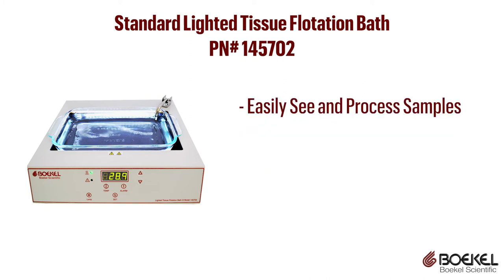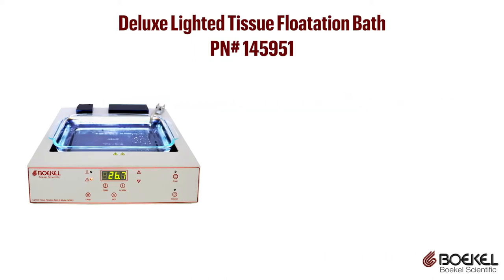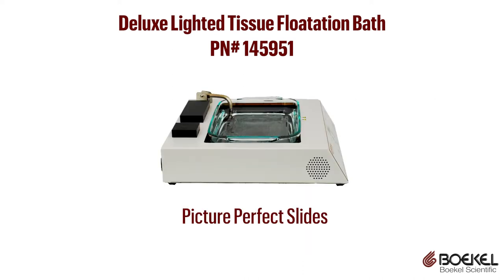Easily see and process samples using this device. The deluxe lighted tissue flotation bath also has precision digital temperature control, but also features a slide dryer heating block and a tissue orientation block built into the back of the unit. The deluxe lighted tissue flotation bath has all the tools needed for picture-perfect slides.